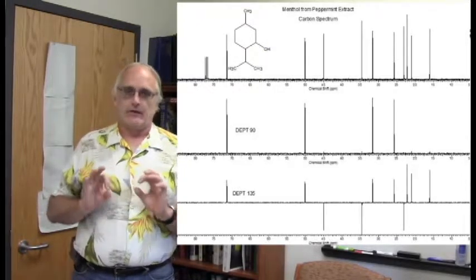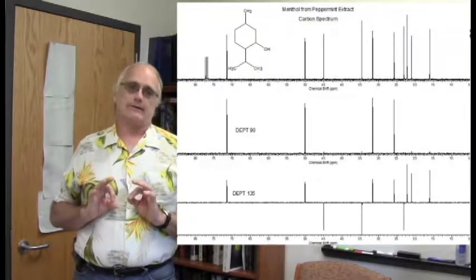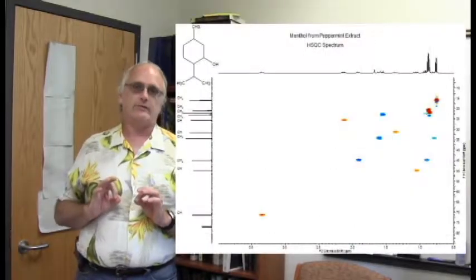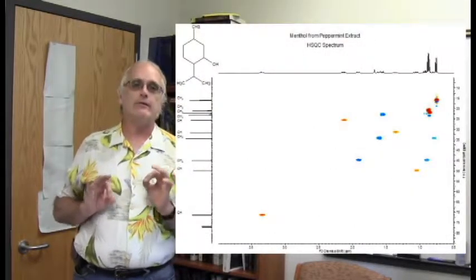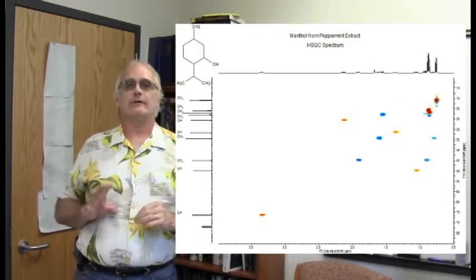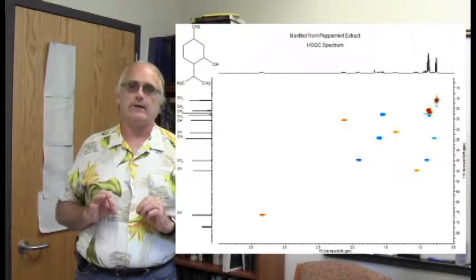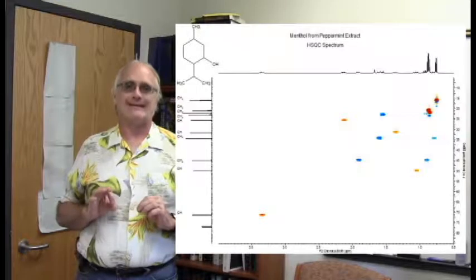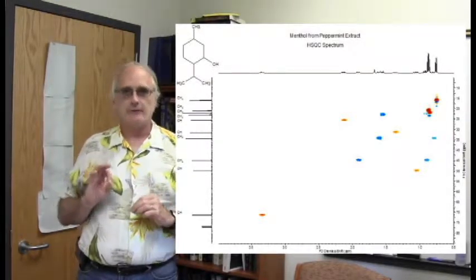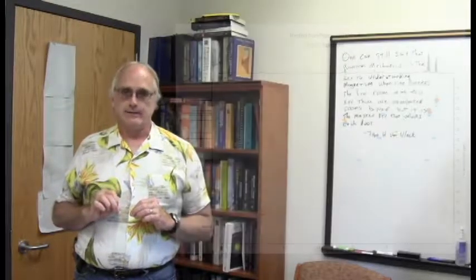We've gotten ourselves a bit oriented, and there's one other critical thing to do by looking at the carbon and the DEPT spectra, and that is take the HSQC, as yes, we are going to make extensive use of it, and put the DEPT results in. In other words, before you even examine any of the spots, any of the correlations on the HSQC, make sure the HSQC looks like this one, where all of the DEPT results, exactly which carbon is a CH, a CH2, or a CH3, have been written in.